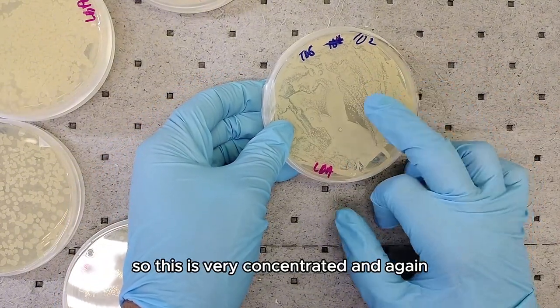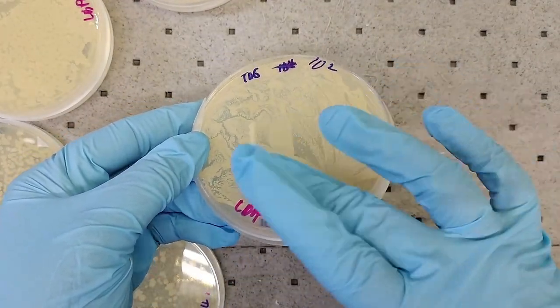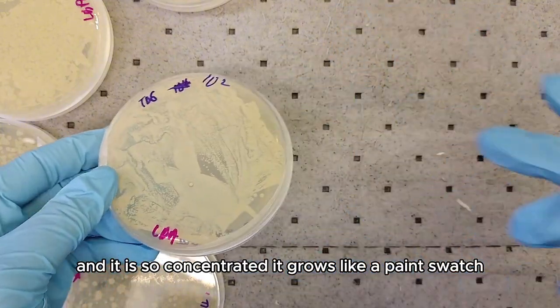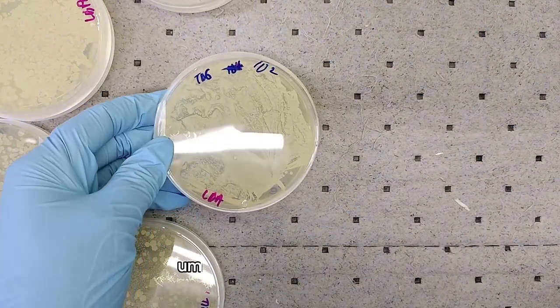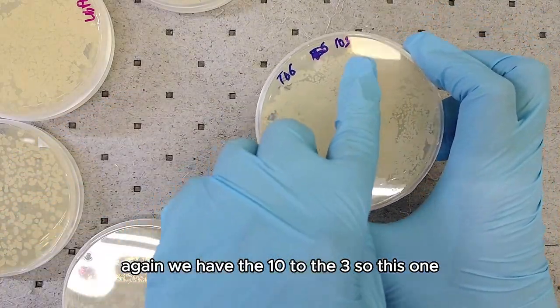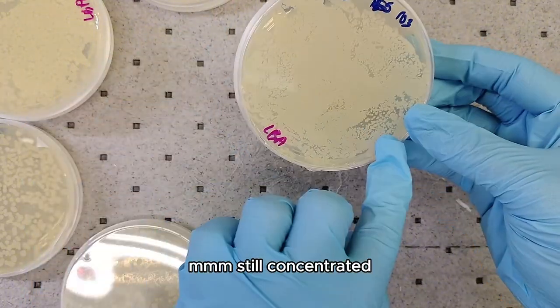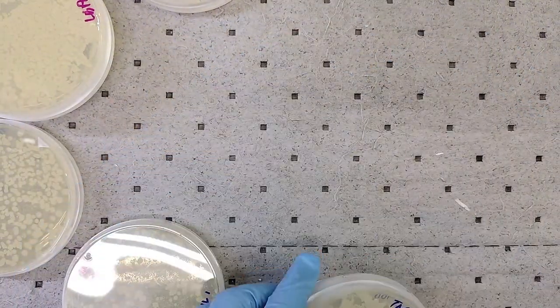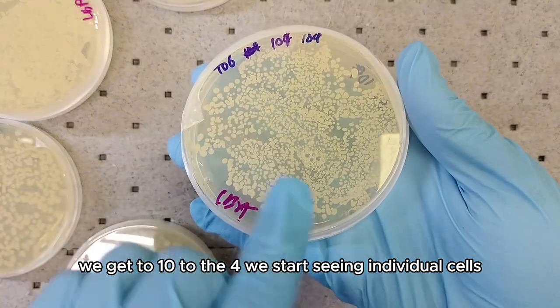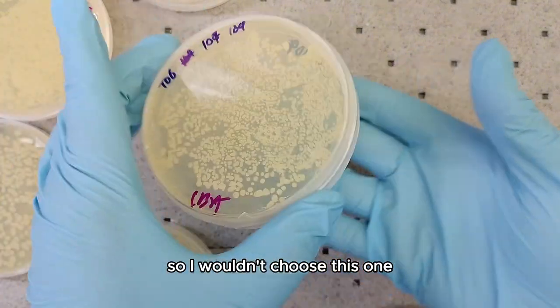This one is 10 to the 2, so it's very concentrated. You can see this is a different microbe and it is so concentrated it grows like a paint swash. The 10 to the 3 is still concentrated — I'm not seeing individual colonies. At 10 to the 4 we start seeing individual cells, so one could count, but I can tell it's a lot so I wouldn't choose this one.